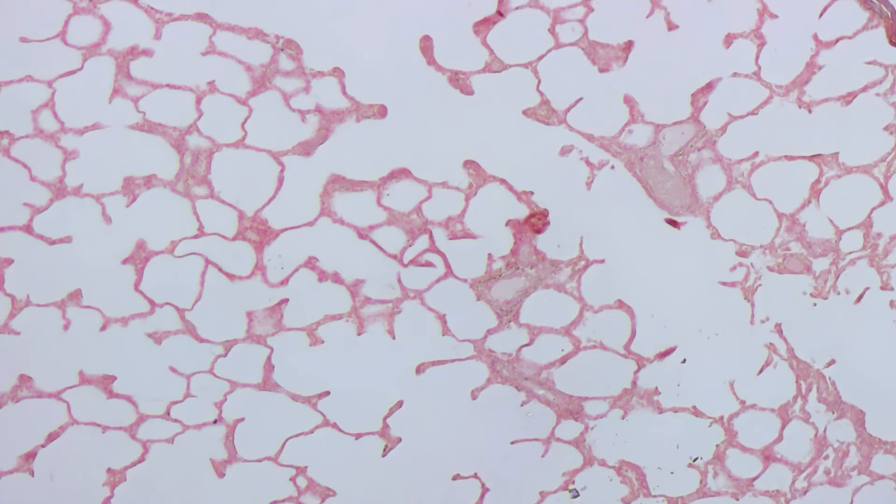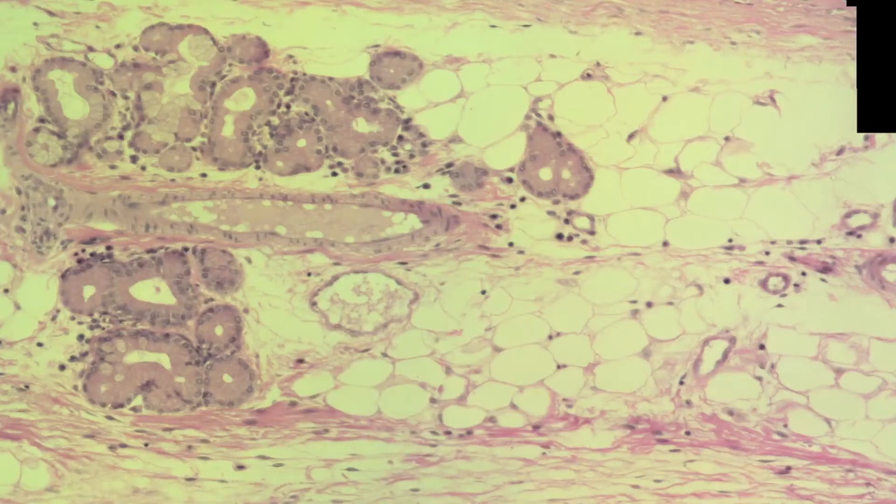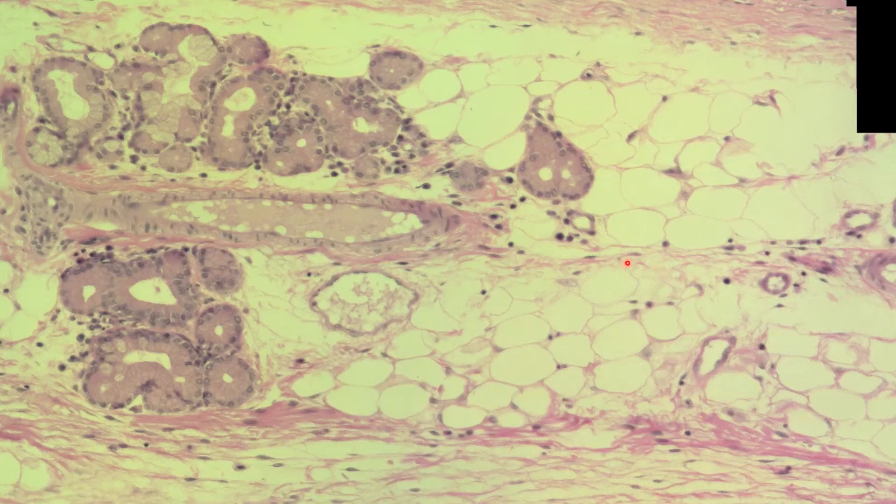So now that you have that in mind, this should be easily identifiable as simple squamous. And this should be easily identifiable as adipose.